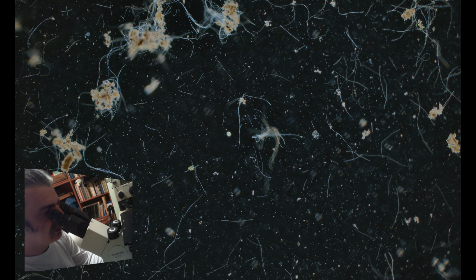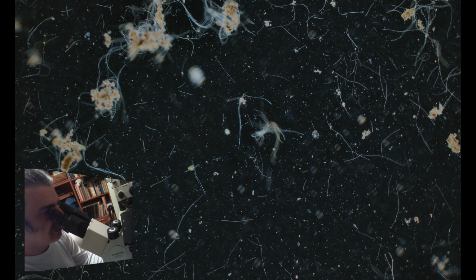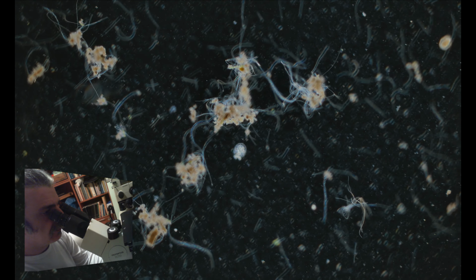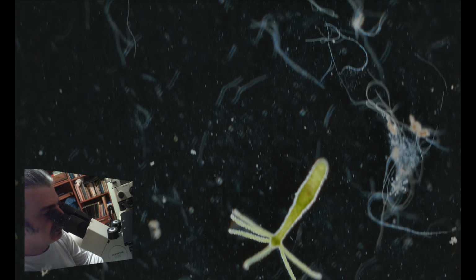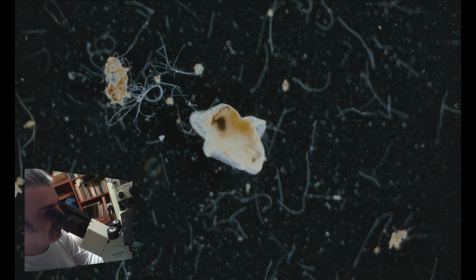Here is another ciliate. I don't know exactly who it is yet. And here is another beautiful rotifer, Testudinella. Moving on, another hydra. I'm just creating a virtual map in my head.